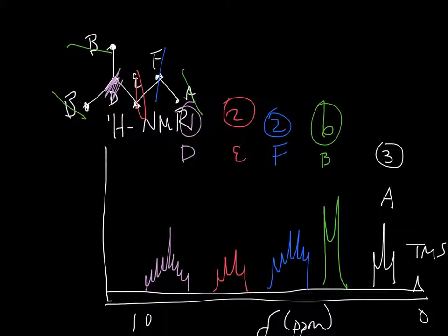I want to do something that I haven't checked in the most recent edition of your book, but in the earlier editions it did not have this. It's not cheating, because it's an equation that you will need to memorize. We're now going to learn how to go from the NMR structure to drawing the compound. We're going to work backwards.